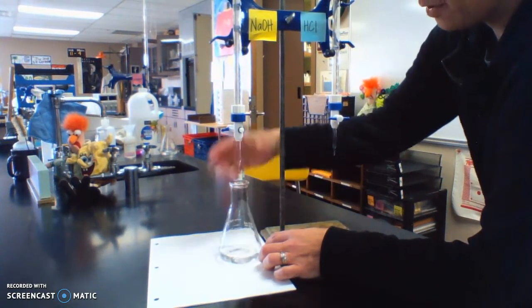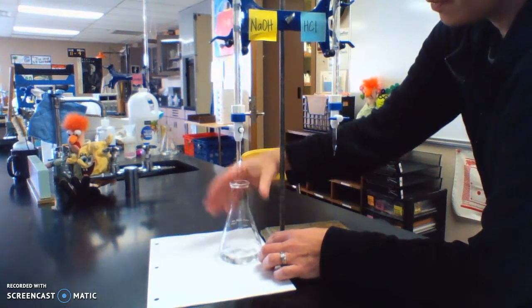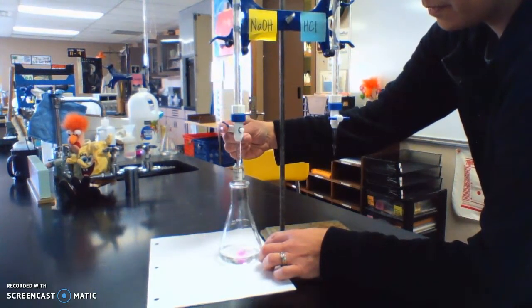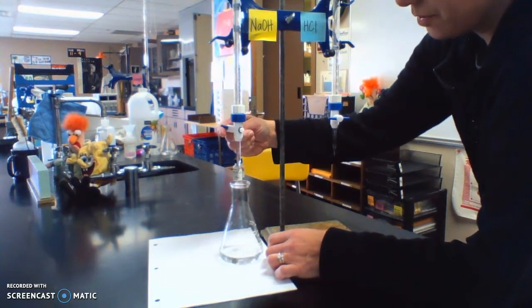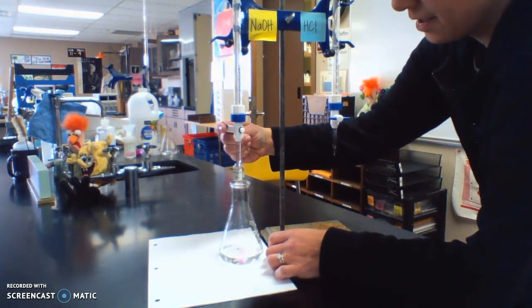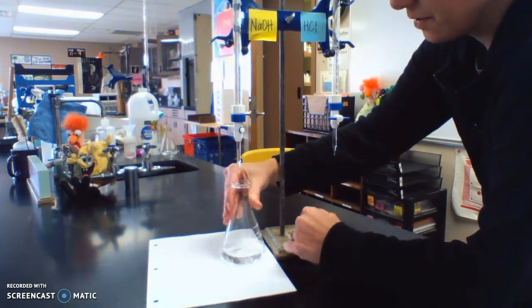I'm at 18 or so right now. 19 or so, so I'm going to go much more slowly. You know, we're close.